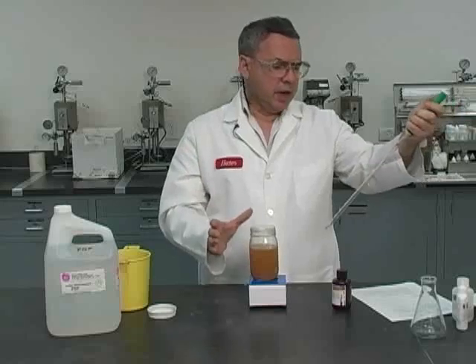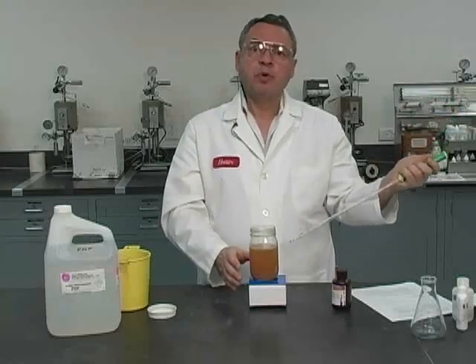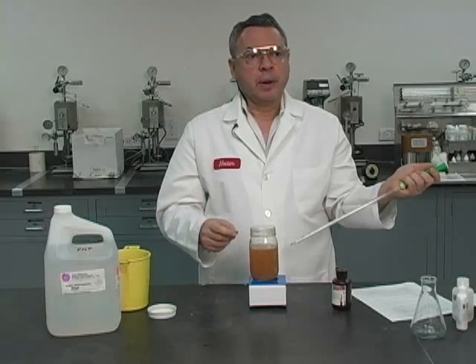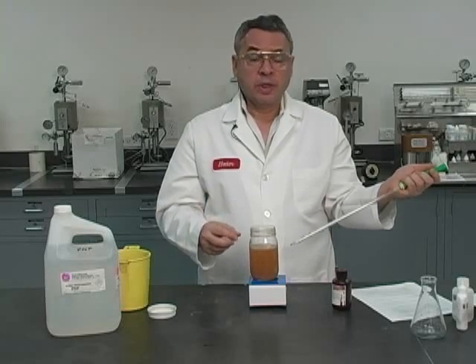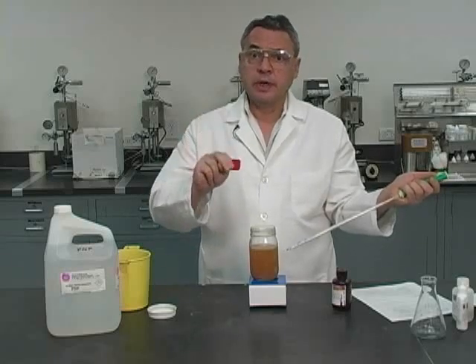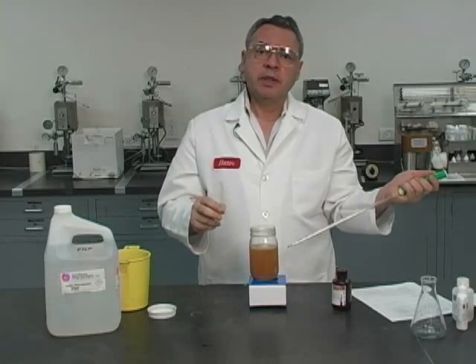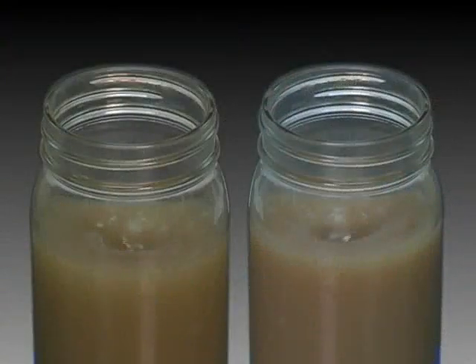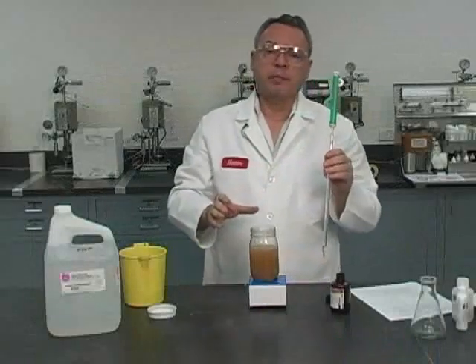So briefly, the calculations would be 9.4 times 10,000, that comes to about 94,000, divided by 2, which is the size of the sample. We got 2 cc's. So we come to 47,000, and this is milligrams per liter of mud, of whole mud. That's practically the salinity of this invert emulsion we just checked. And this concludes the determination of chlorides.